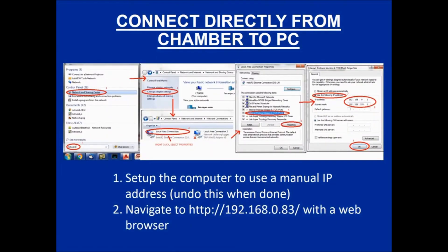For this third method, you will need to set up the computer to use a manual static IP address as shown on the screen. On a PC, go to your network and sharing center in the control panel and change your adapter settings by right-clicking on the local area network connection. Select internet protocol version 4 and click the properties button to manually add the IP address.